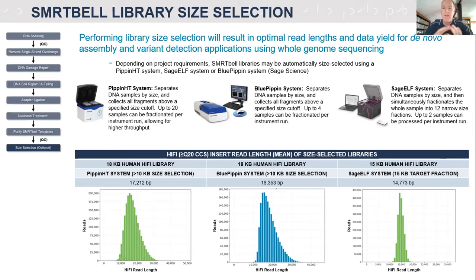And as I say, this is a very general overview because I know you're all begging to get into bioinformatics analysis, but we thought it was important to present what's important at the very beginning with your sample and your library in order to give yourselves the best chance of getting good quality data. And also, if you're looking at data and you see some problems, to perhaps think why that problem may have occurred. Was it something about the quality of the starting genomic DNA? Was it something about your size selection, perhaps? You can start to troubleshoot. And of course, that's what we're here for, to help. So if you ever come across these problems, reach out and we'll try and troubleshoot with you.